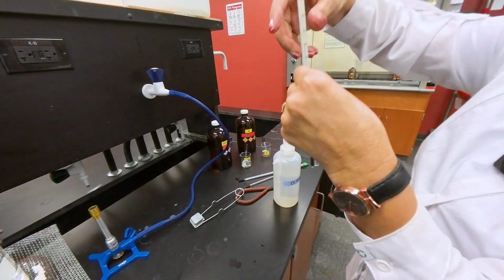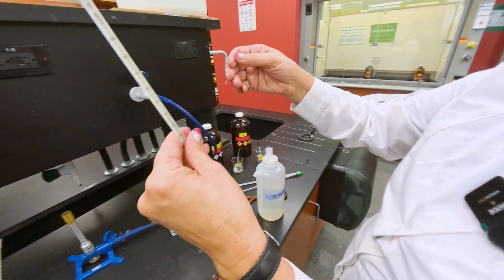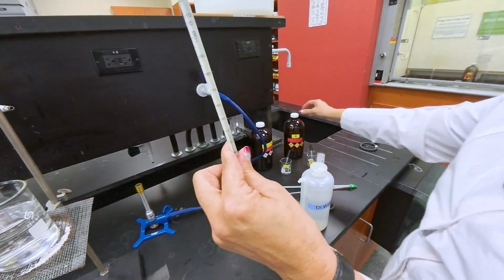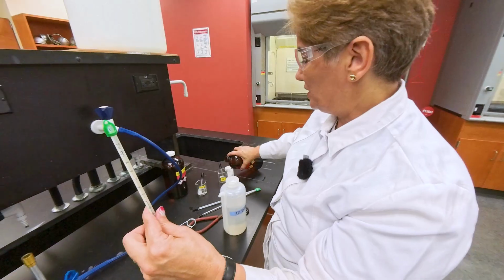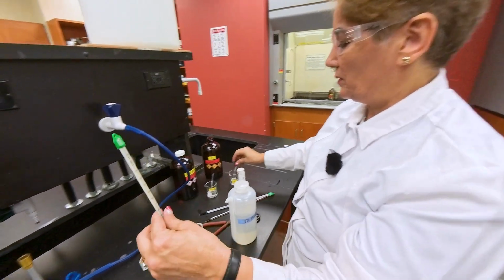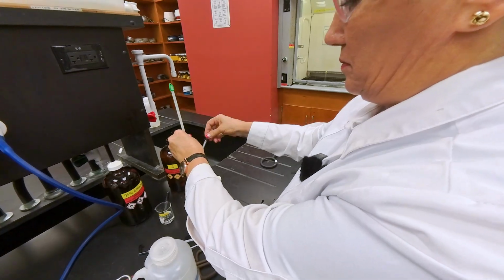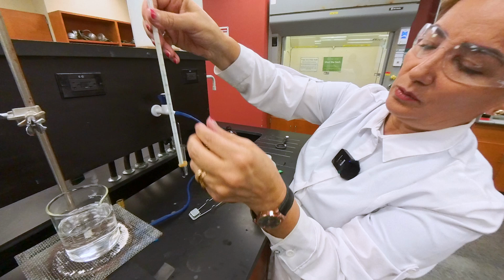I place a capillary tube in with the closed end up, open end down. It goes inside the seal tube. And I place my unknown, because we are already done with the known sample. I'm going to place a few drops of the unknown into the seal tube. And we place this in the water bath.